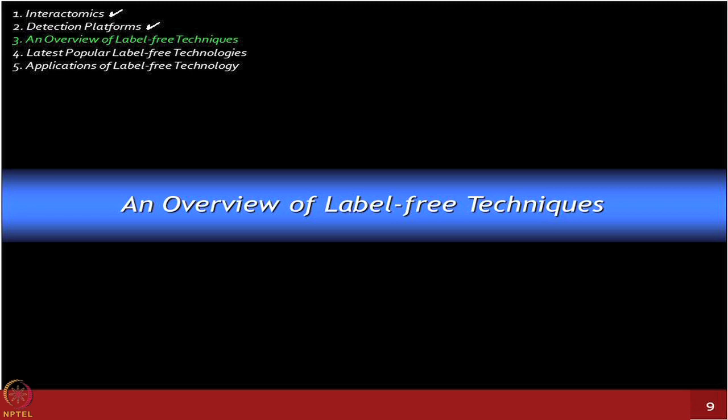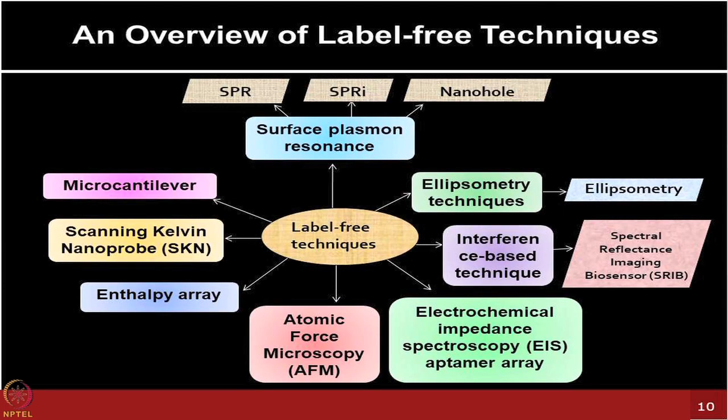And there are a lot of physics people who are actually contributing towards making many types of biosensors, where they involve different physical principles, and how they could be used to measure molecular interactions. So, I'm sure you can find SPR, just one among them, one of the label free platforms which can give rise to multiple technology platforms, including surface plasmon resonance, which we talked about briefly, surface plasmon resonance imaging based platform, SPRI, or nanohole arrays. All these 3 depend on one of the principles, which is SPR.